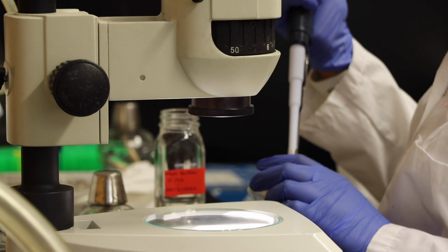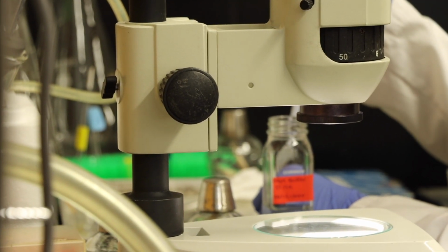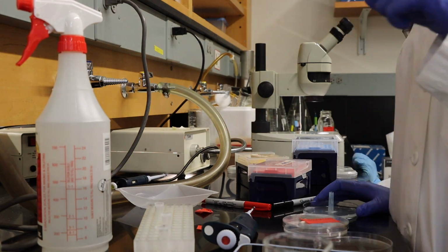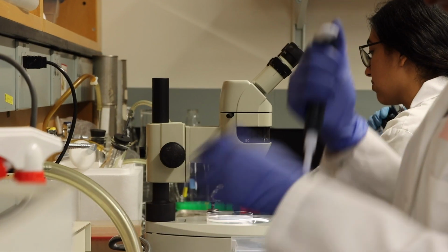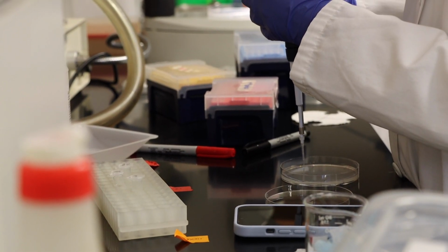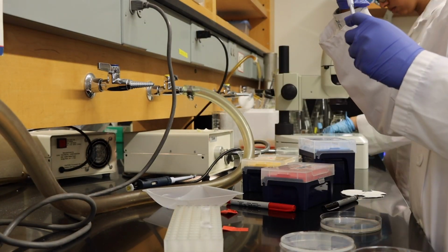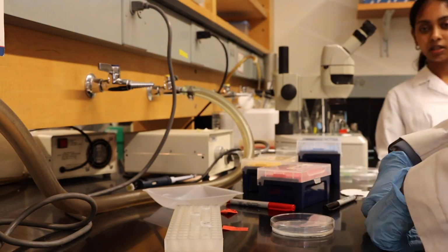A worm trap is created through cutting a 1,000 microliter pipette tip and attaching it to a square cutout of mesh by melting the pipette tip. The worms are washed with NGM buffer through the worm traps 3 times. The 2 circles on either side of the chemotaxis plate are then spotted with 0.5 microliters of sodium azide paralyzing solution. This will paralyze the worms if they were to enter the circles of either the isoamyl alcohol or ethanol based on which circle they enter and allow them to be counted.